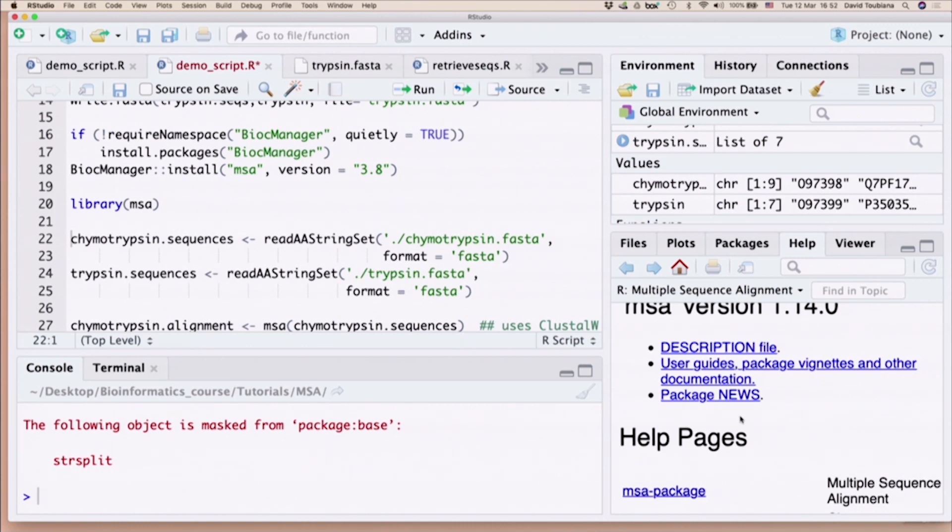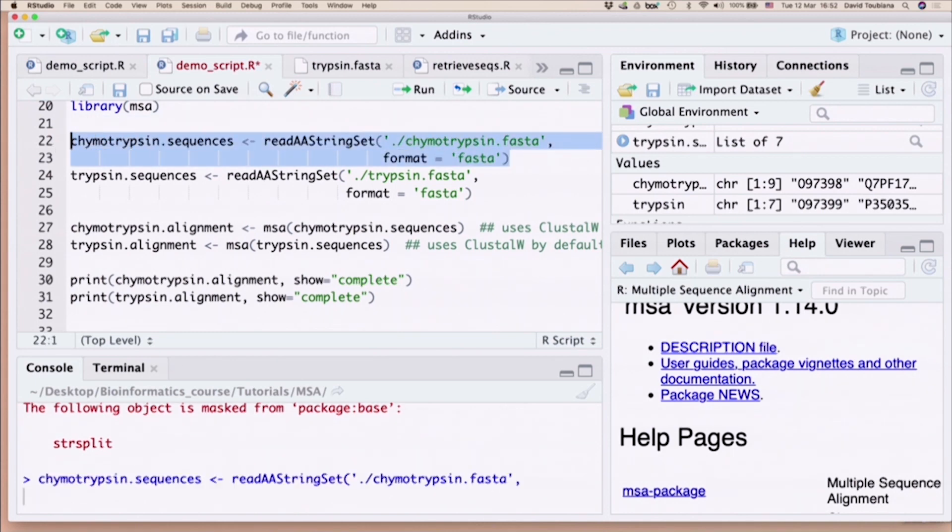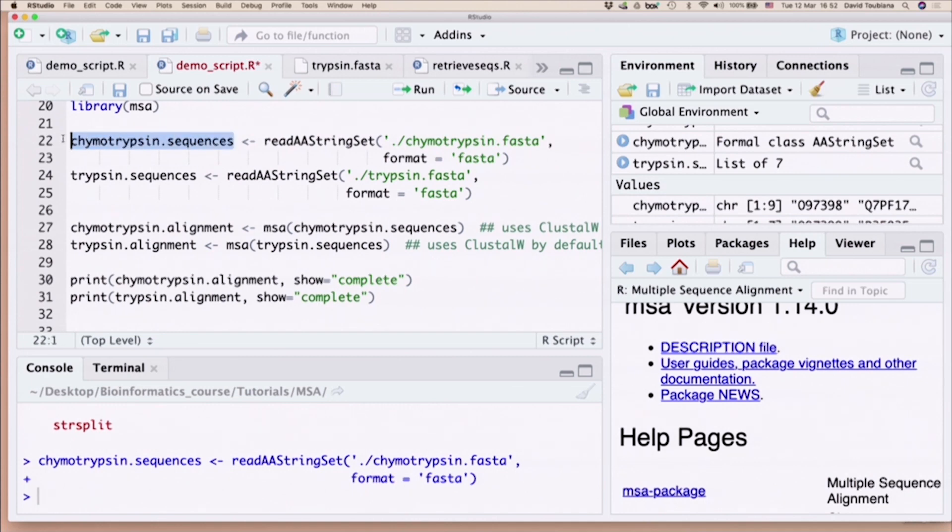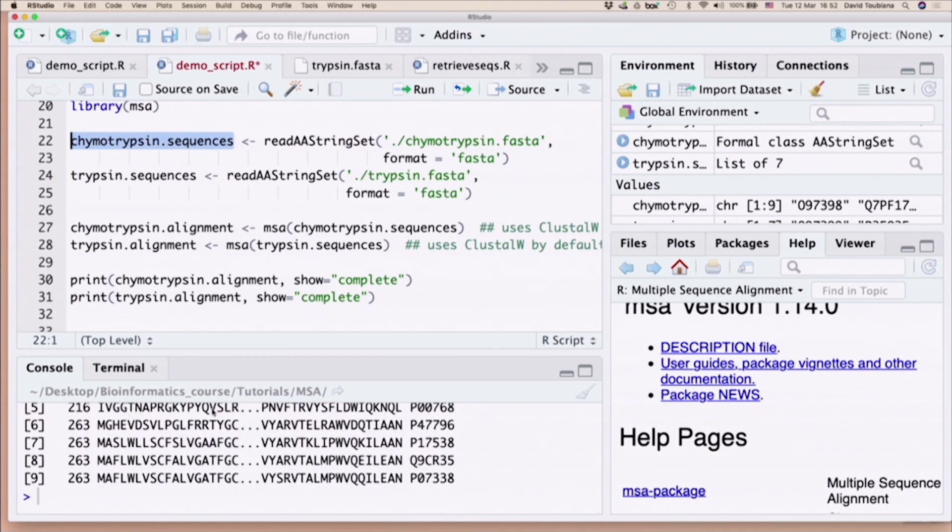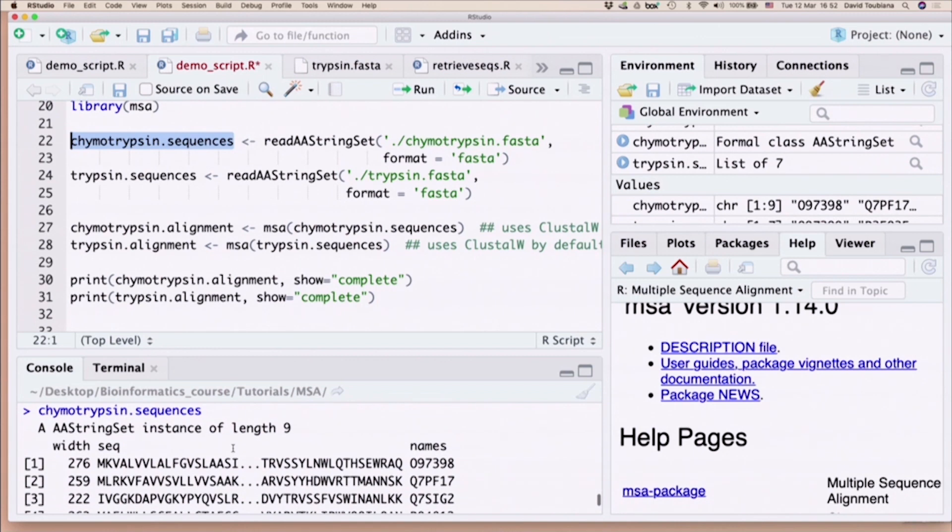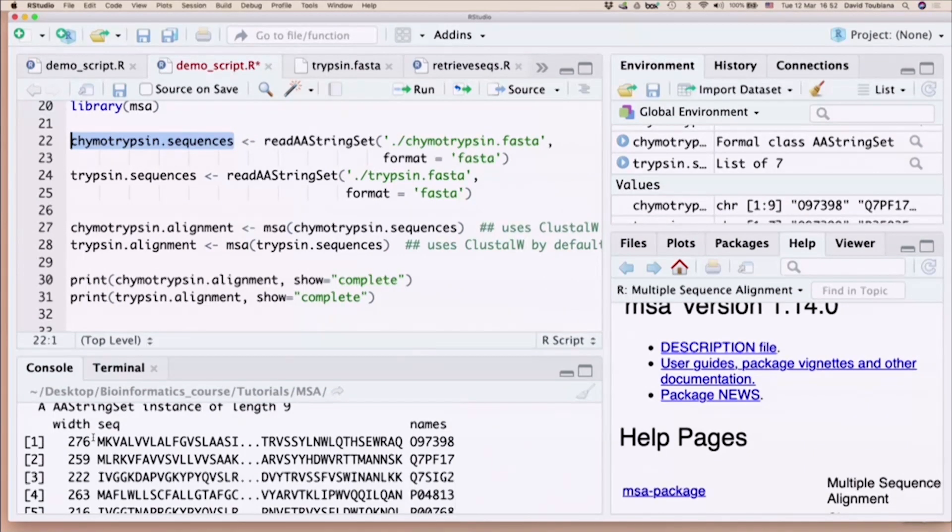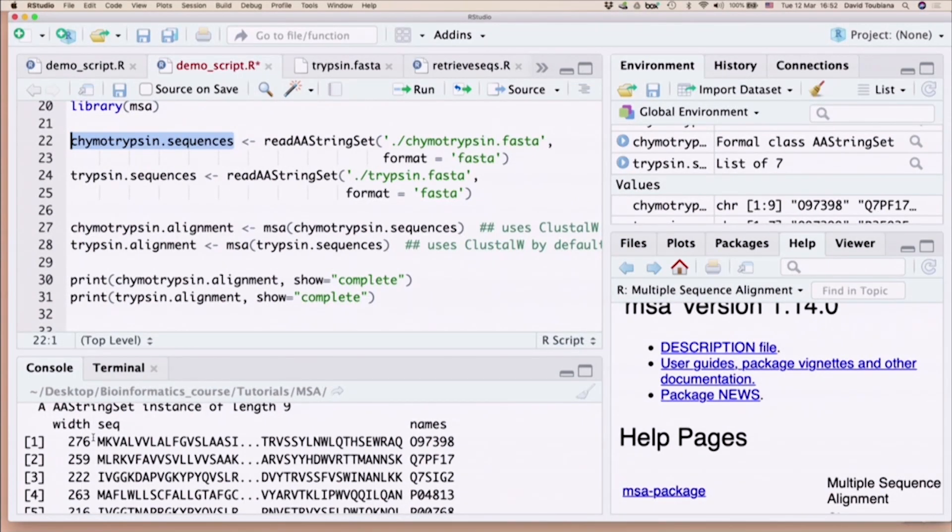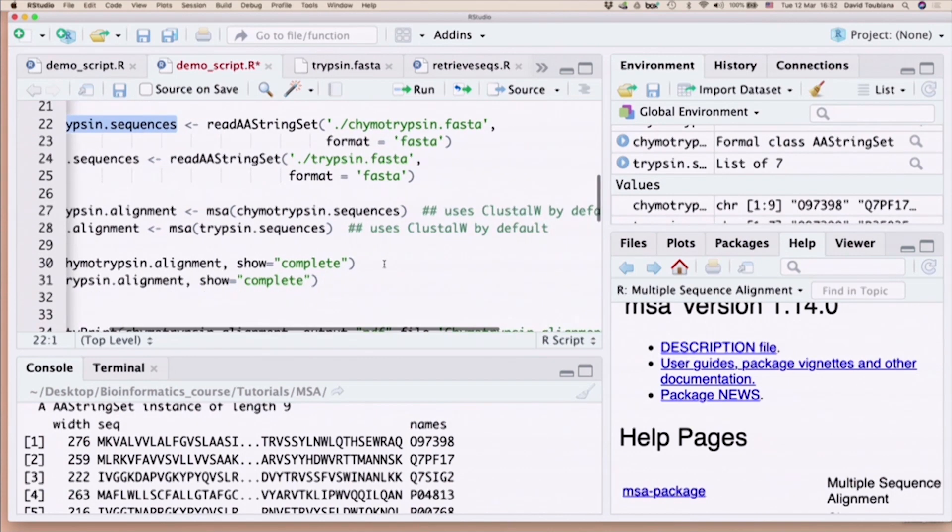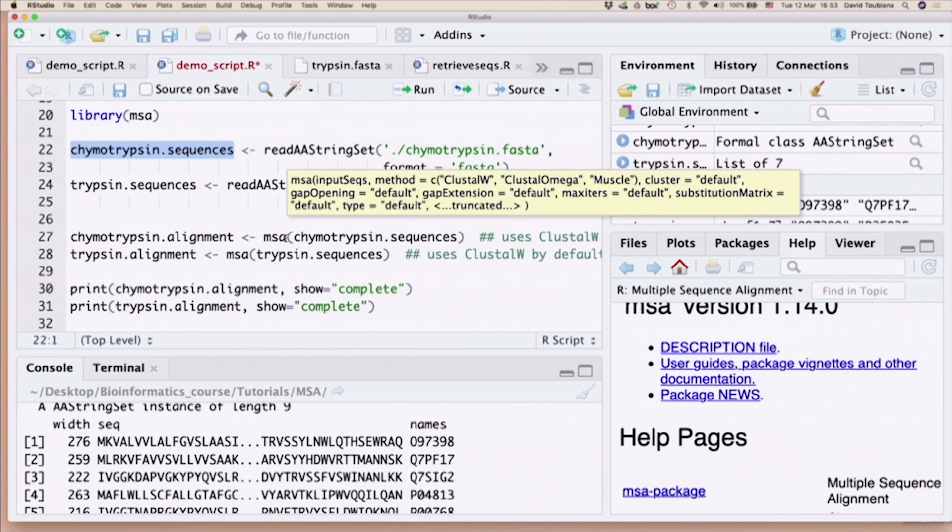We will do the last thing for today. So I read in into my variable. I'm looking at the variable. You will see down here, it will show me just a glimpse of it. I have those nine different variables. It will tell me the width of each variable in the first column. The first variable has 276 different amino acids. At the end, it will show me the beginning and the end of my sequence, and then it will tell me the name of the sequence that I assigned before. Now, if I want to do this multiple sequence alignment, I use the function called MSA.